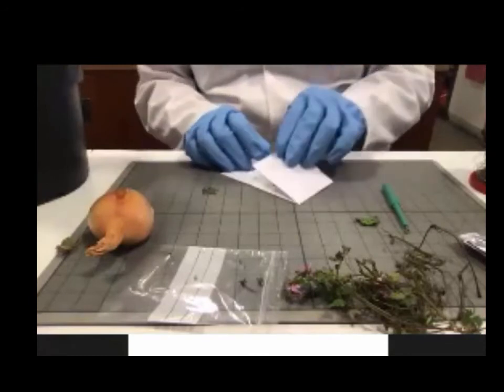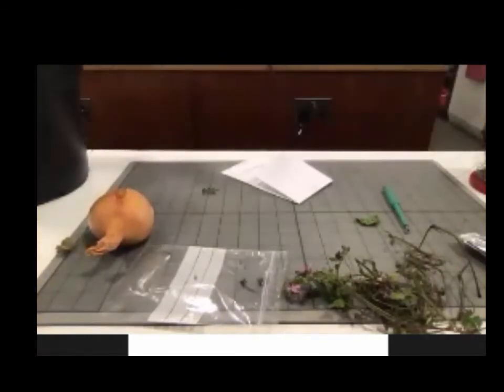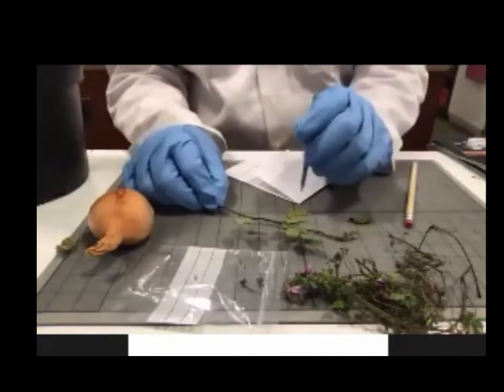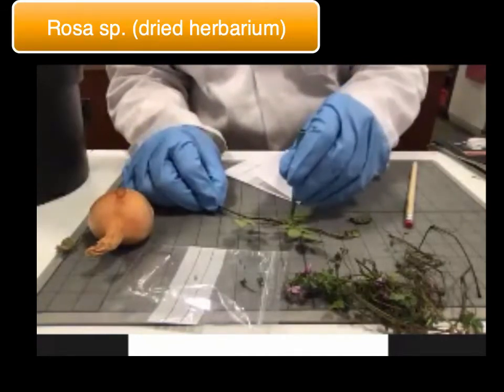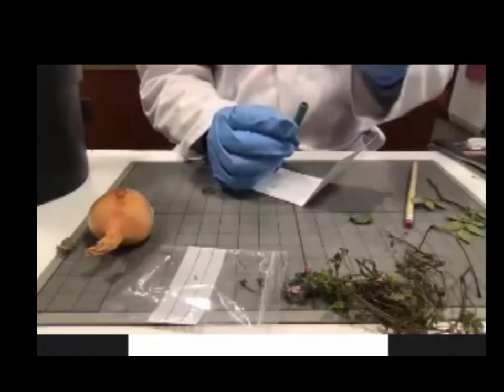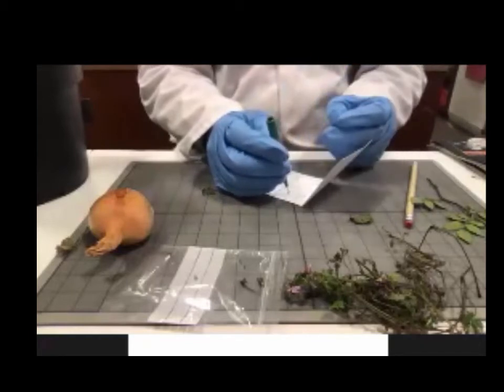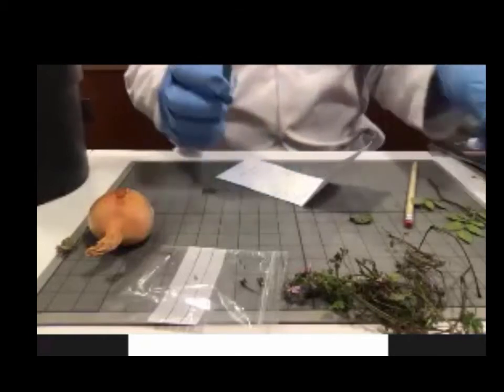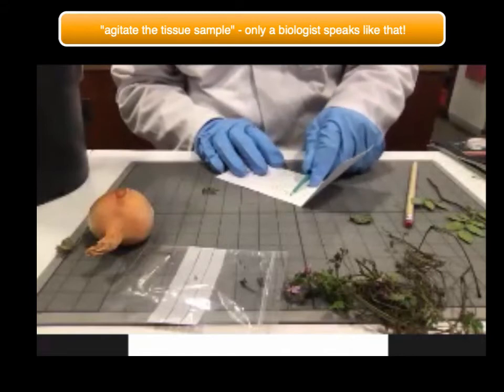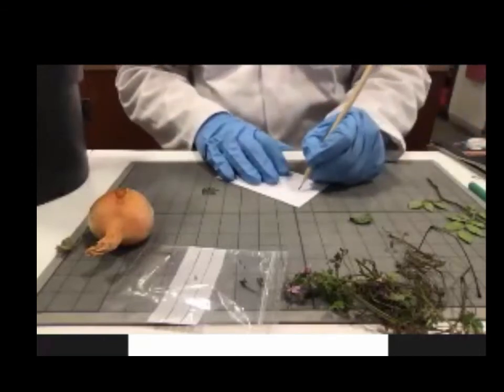But what we're going to work out is whether they are really related to each other. We should probably also do a plant that is not related, so we'll get a few bits of rose, and that will be like a control. Again, just agitate the tissue sample.